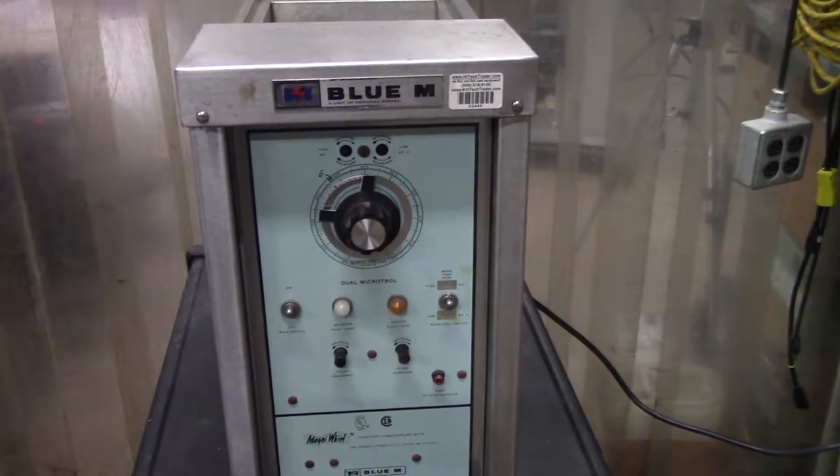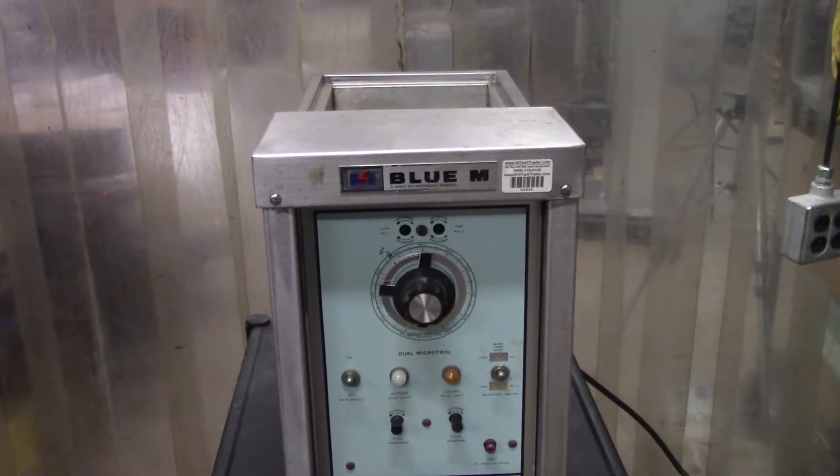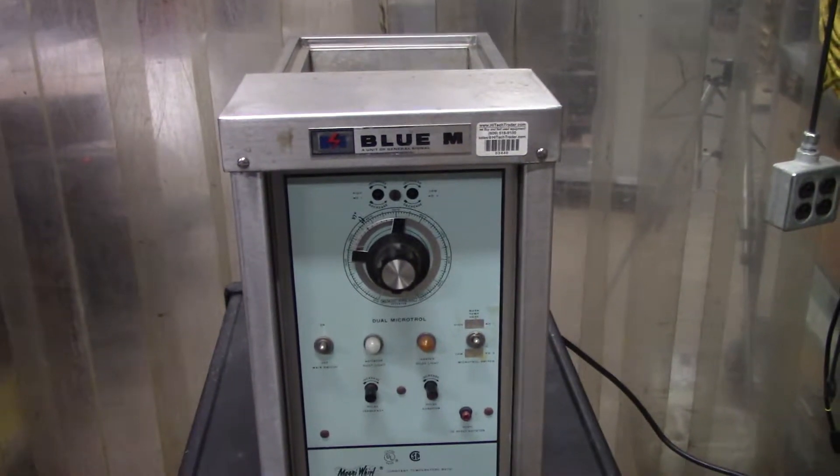Hi, this is Michael from High Tech Trader. Today we're looking at a classic Blue-M Magna Whirl.